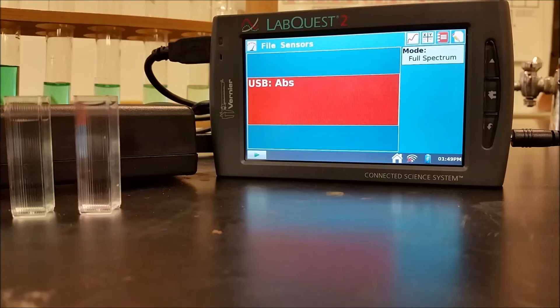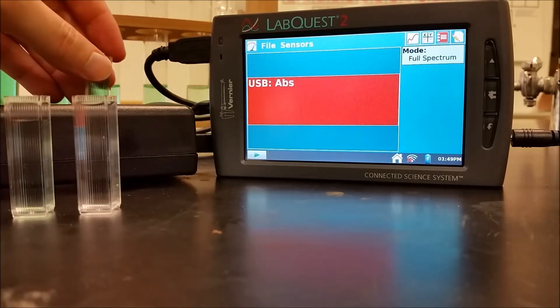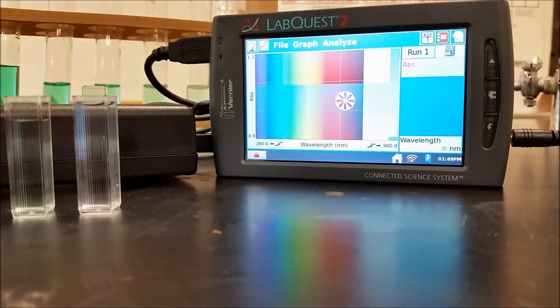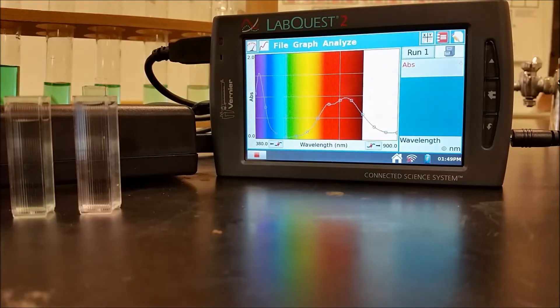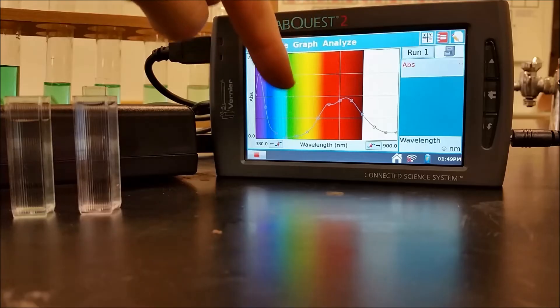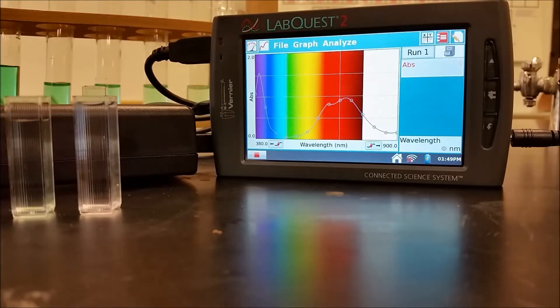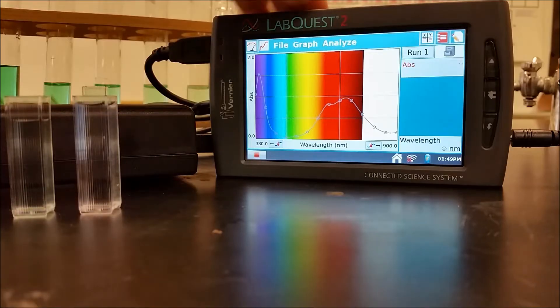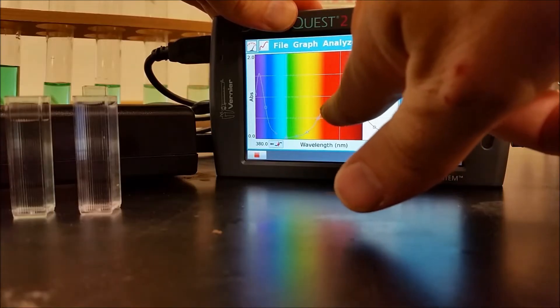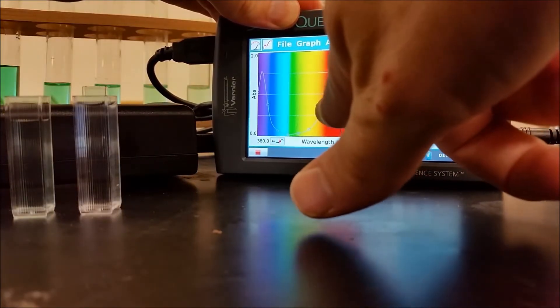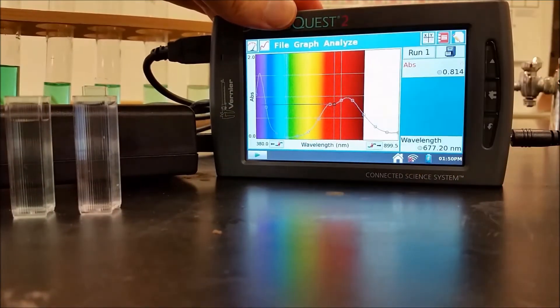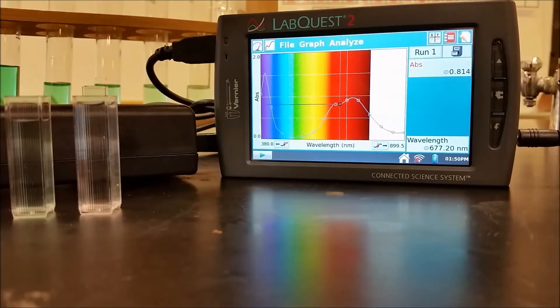So the first thing I want to do is pick my wavelength to use. So to do that, I'm going to put in my most concentrated. I'm going to hit Play. And this is going to show me all of the different colors of light that are being absorbed. So this is absorbing some in the violet spectrum, some in the red, and then the green is being transmitted, which is why that's the color that we see. So I'm going to need to pick a wavelength. Ideally, you pick one that's kind of higher than the other ones, but I'm going to pick one that's actually in the visible range. And of course, it helps if you hit Stop. So when I set that there, that's going to automatically now set that to be able to run.